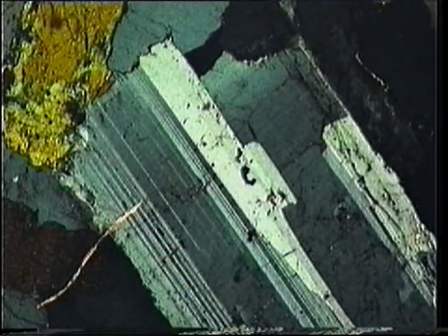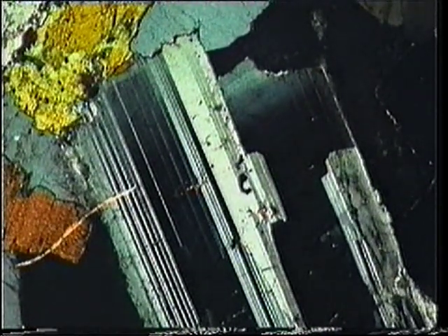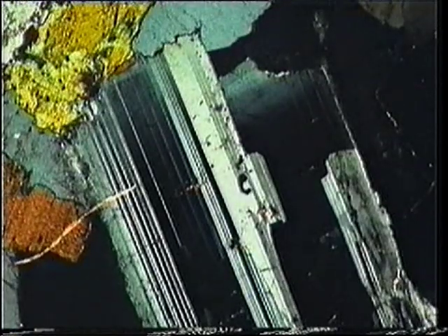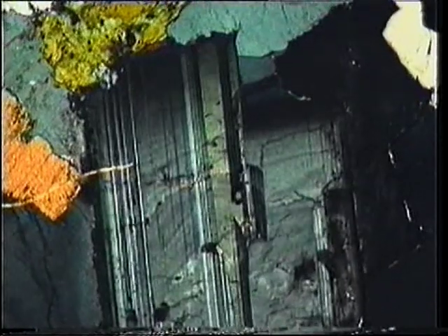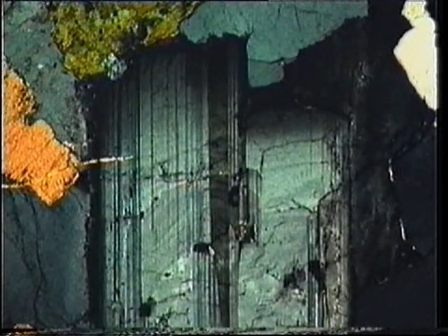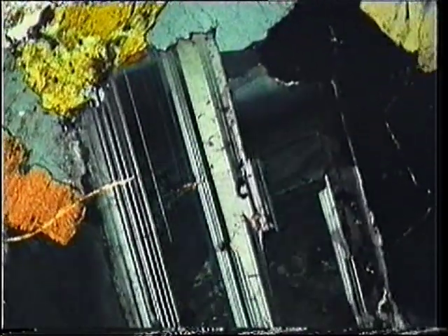The chemical composition of plagioclase crystals commonly varies from the middle or core to the margin or rim. The core typically has a higher extinction angle than the rim. Thus, the core is more calcic than the rim, and this is called normal zoning.